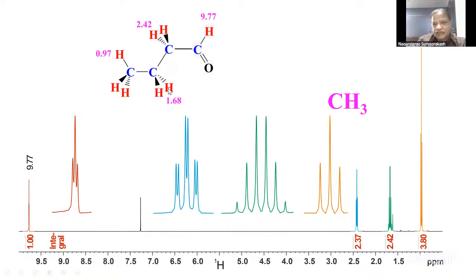And these CH2 protons and these three CH3 protons, there is an interaction called J coupling. Because of that, this CH3 proton will be a triplet because of two equivalent protons. And I will safely say this is a triplet because of CH2 and this CH3. You may ask me a question, what about this one? This is also a triplet.